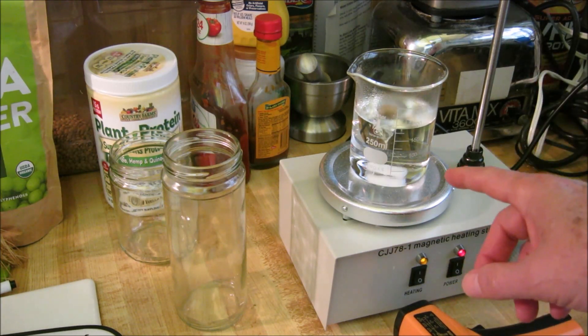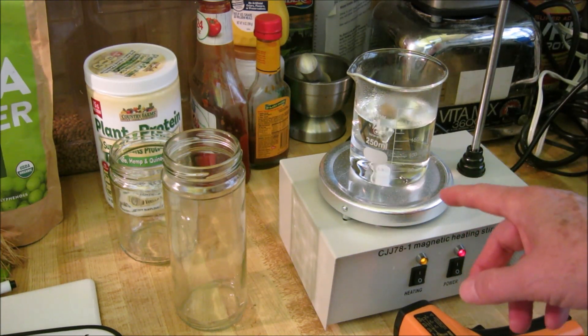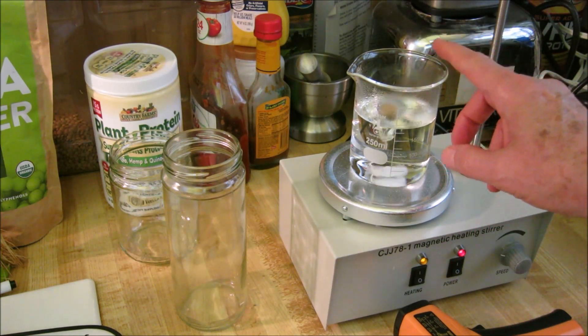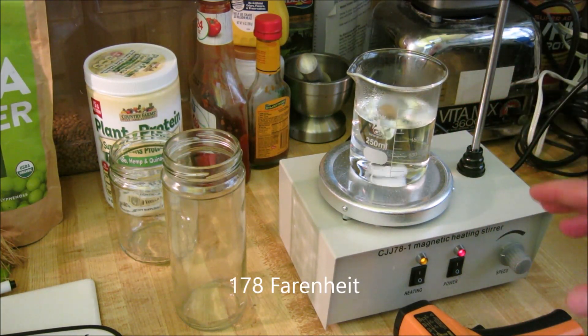It took a long time to get to, 45 minutes to get to only 178 degrees. So if you're trying to boil something, it could take a long time.